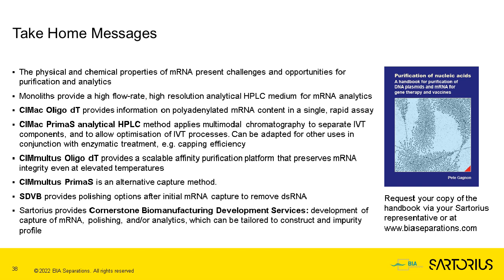Can you monitor various capping reagents? That's a good question. In one of the slides, I've shown a chromatogram that distinguished between ARCA capping or CleanCap AG. I didn't show the example for CleanCap GG, which would also be baseline separated for those two as well as from the nucleotides. So for all of the major, let's say, clinically relevant capping reagents currently used, you can use this method to quantify also their content in IVT reaction, yes.